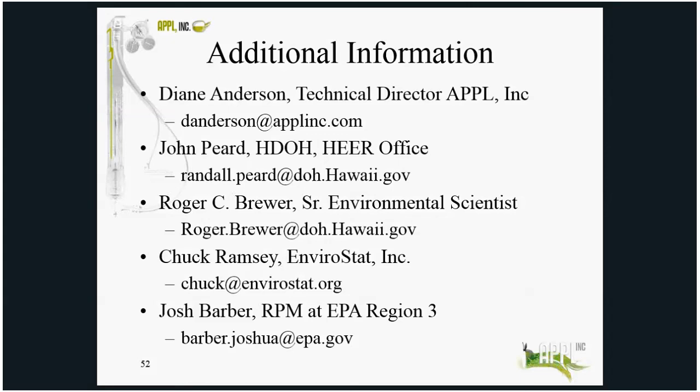Another common question we get is, what's the additional cost for sample processing, like a rough range, and is there an additional cost for grinding on top of that? You have to be real specific. Some sample processing, depending on what it is, we can do wet incremental, wet sieve incremental, dry incremental, or dry sieve incremental. So anywhere from, say, an additional $25 up to $110.